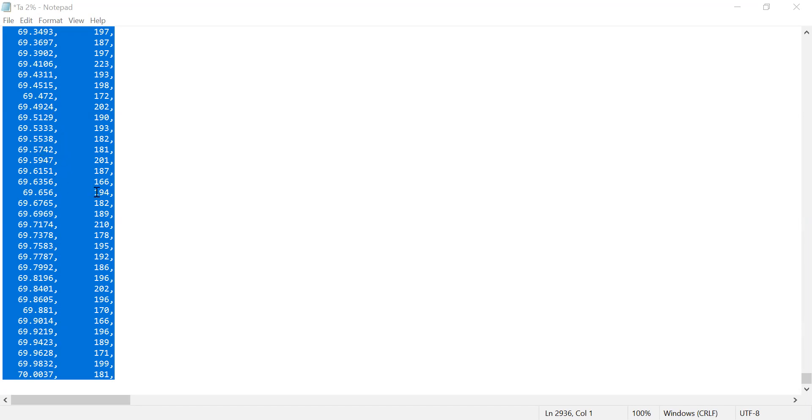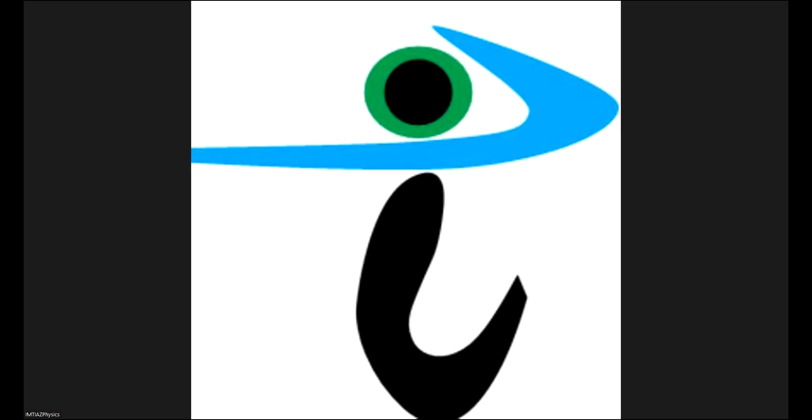First, we should remove this comma from the data. For this, I'll simply copy the whole data and then paste it in an Excel file. Let me open the Excel file.